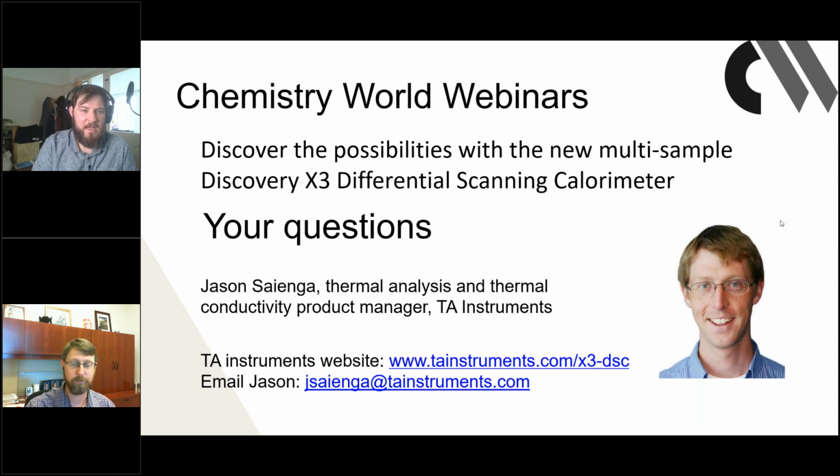Yep. That's good to know. Alex said, thank you for the nice presentation. So props to you, Jason, there from Alex. He says he appreciates the high throughput, etc. But when should we use the DSC 2500 and then the X3?